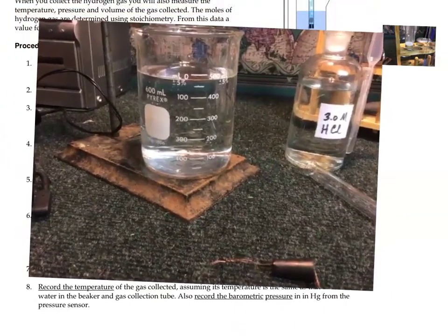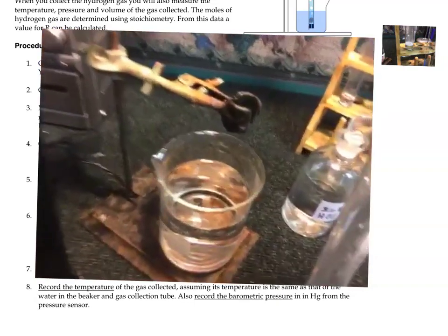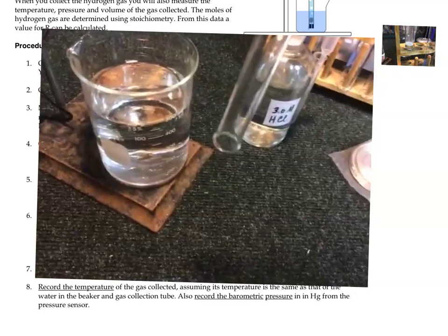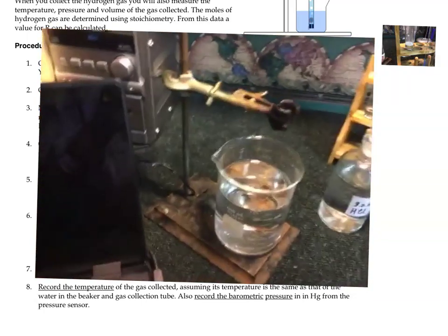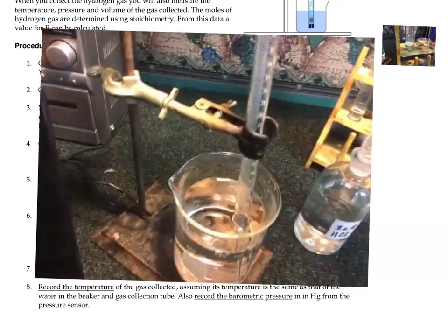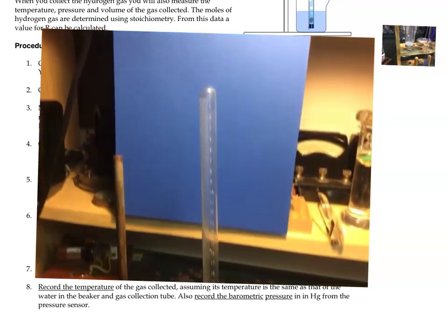All right, what is this going to look like? There's our beaker. And a eudiometer is essentially a very long test tube like this, and has graduations on the side like a graduated cylinder. Usually you use it kind of upside down like this. And that's going to get clamped into this burette clamp right there like that. And the reaction is going to happen inside of it.